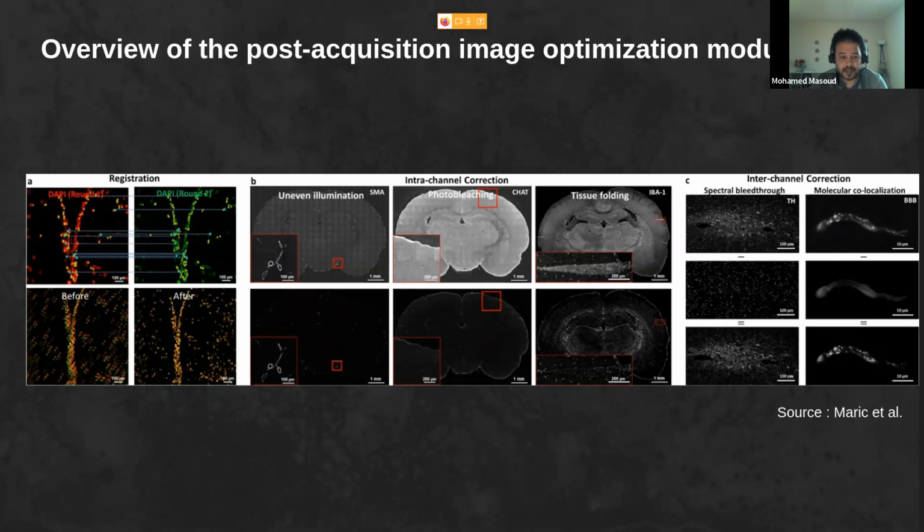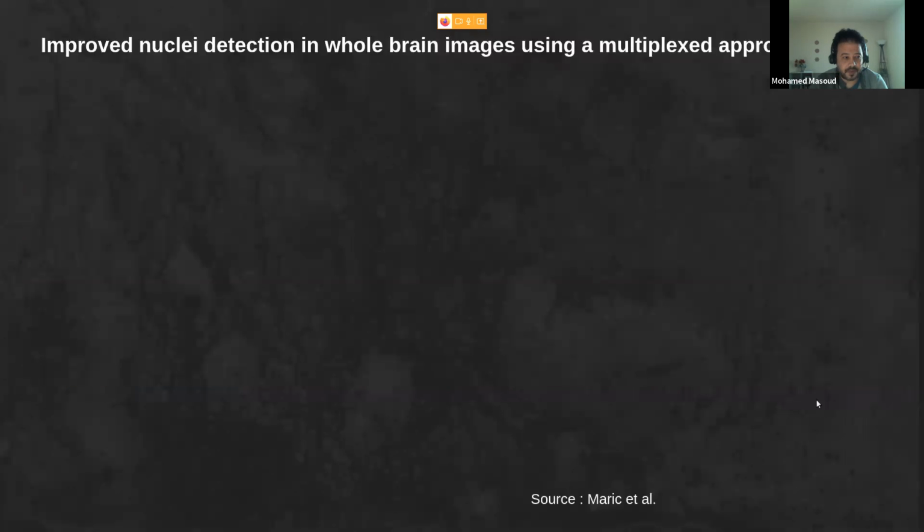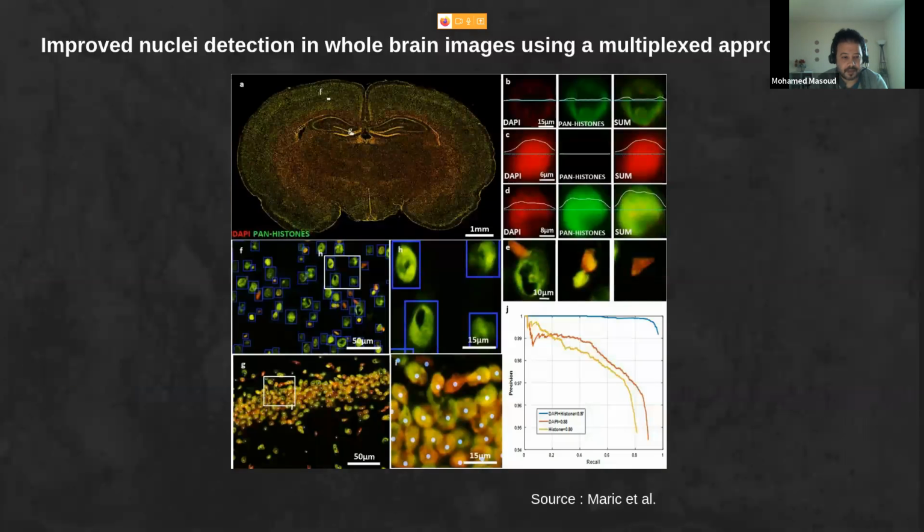Based on that, they moved to find the bounding boxes that can identify the cells in this tissue. One of the things that is hard in this domain is that there is a huge overlap between the cells.